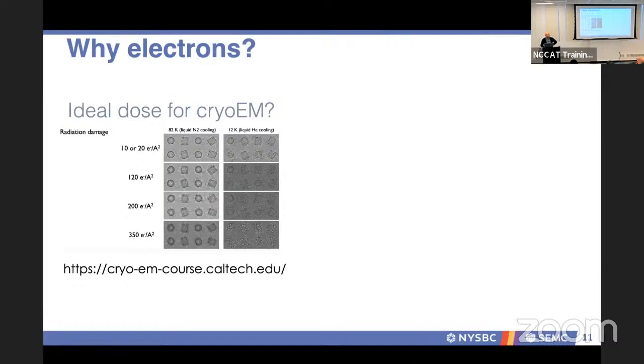But then that Nyquist level of that camera or that microscope may not be the true resolution of the sample after imaging. So there was a thought of how much dose is too much. And back in the day when you're using film or static images, there is a crossover of how much signal to noise, how much energy you're putting in the system, and how much signal you're getting back.